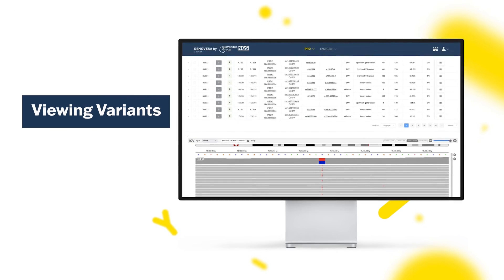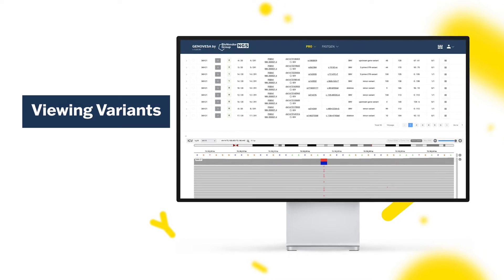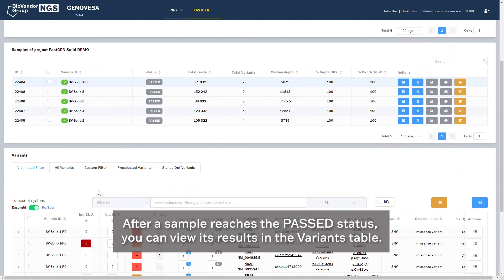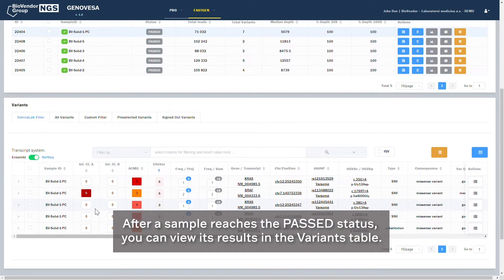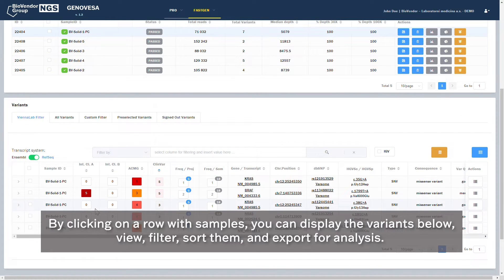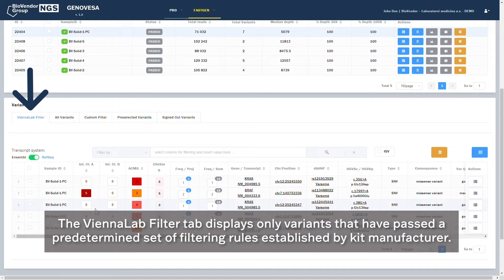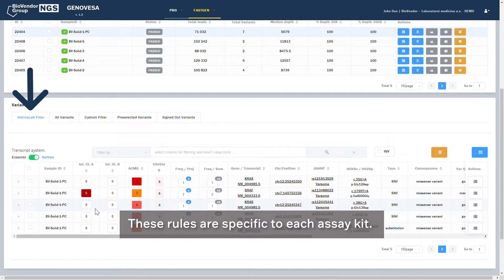Viewing Variants. After a sample reaches the PASSED status, you can view its results in the Variants table. By clicking on a row with samples, you can display the variants below, view, filter, sort them, and export for analysis. The ViennaLab Filter tab displays only variants that have passed a predetermined set of filtering rules established by the kit manufacturer. These rules are specific to each assay kit.